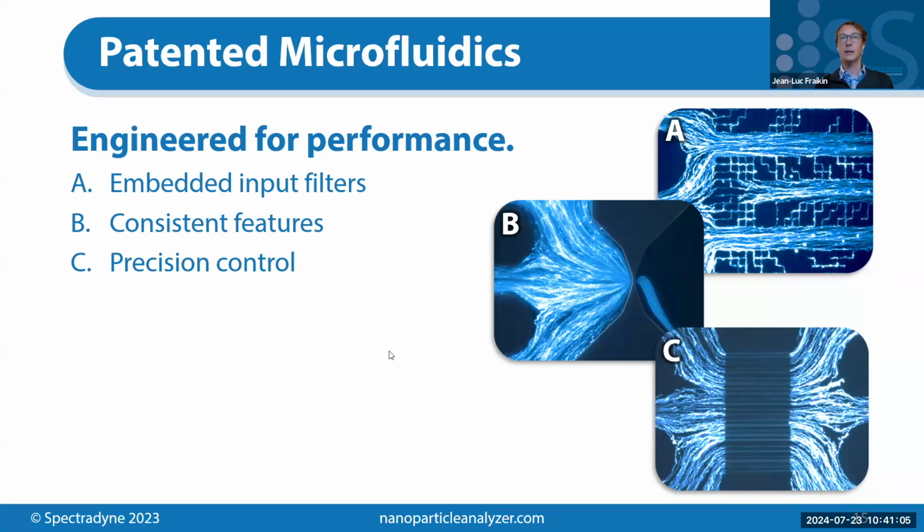It's not sample dependent. And what that means is that on a given cartridge, we can tell you the range of particles that you're measuring. Anything that's smaller than the detection limit, so anything below 50 nanometers, for example, in our smallest cartridges, just doesn't generate a signal that's appreciable enough to be detected. So they can flow through here all day and you won't see them. So really we just measure on the stated range of particle sizes given for a given cartridge. So hopefully that answered your question.